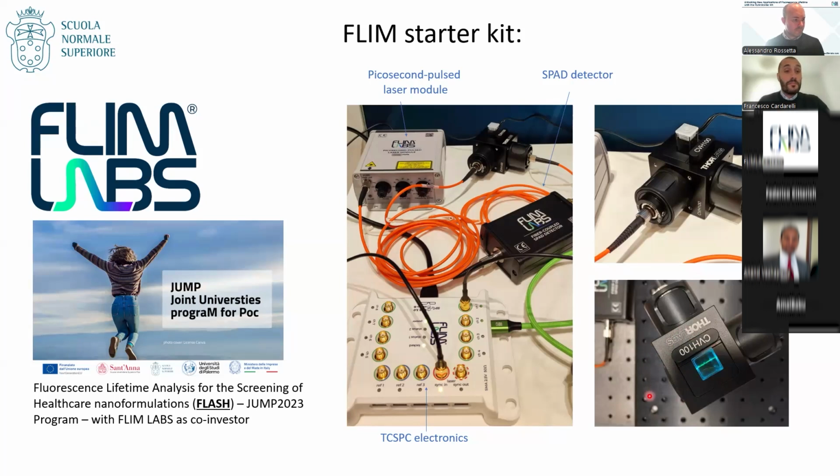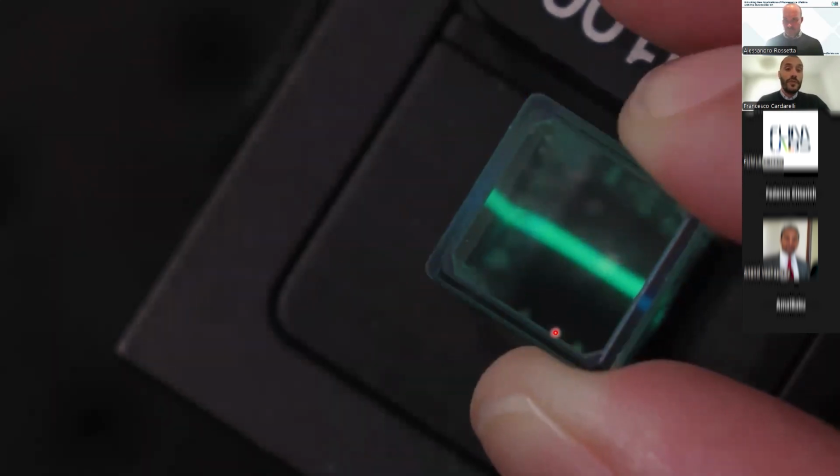And the laser is flashed into the cuvette and excites the drug, fluorescence lifetime is detected, phasor plotted, and then interpreted. You are going to see in a moment a movie demonstrating that the measurement can be performed in real time. So the laser is flashed.